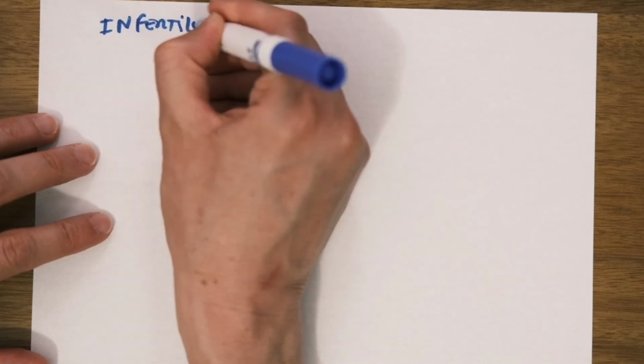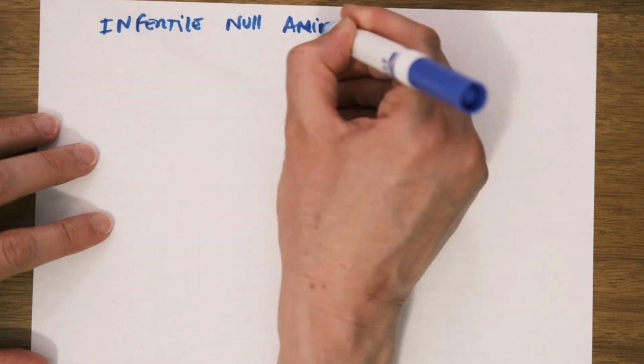Okay, let's start with the most basic situations regarding infertility in null animals. This section will help us revise the pedigree notation and will be critical for you to understand how to handle the Flox colony where the Cre is expressed in the germline. Here we will be covering infertile null animals.